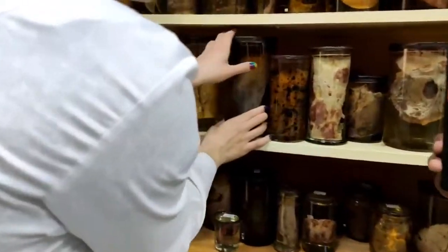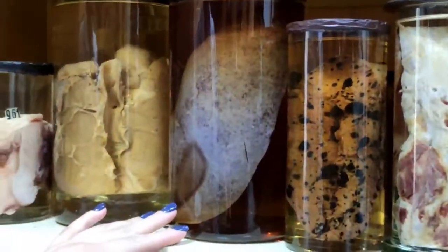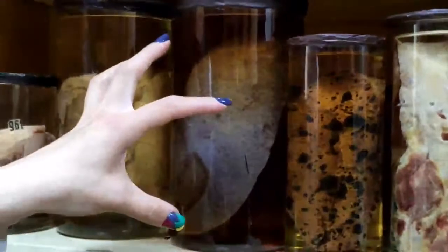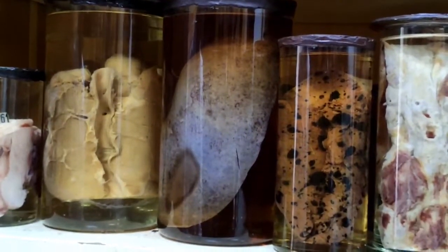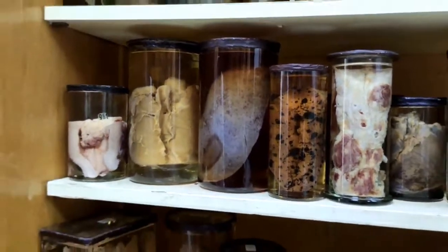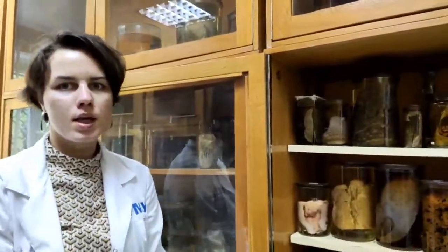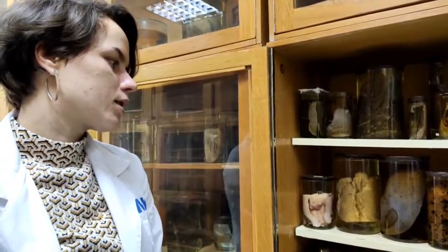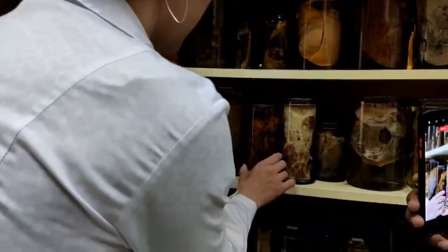The next one is spleen, also in Hodgkin lymphoma, and you can see that this spleen is enlarged, really enlarged, because a lot of patients with lymphomas and leukosis have hepatosplenomegaly, because all blood cells are destroyed in the spleen.